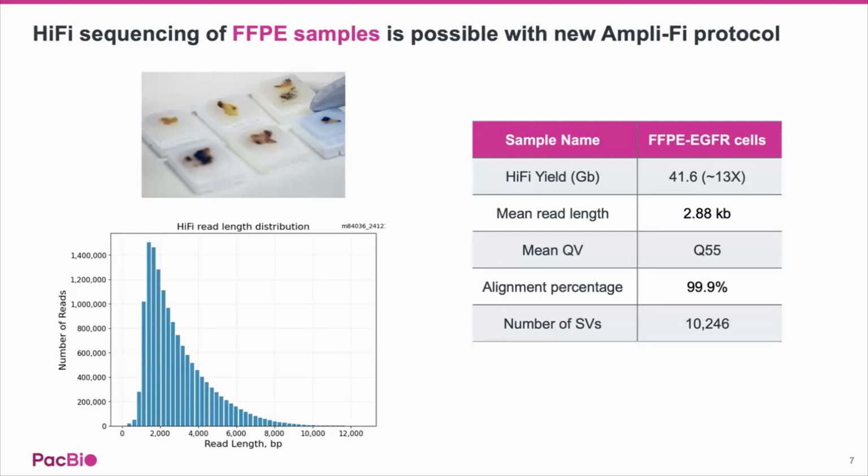The quality of the reads is really high because these short fragments mean many passes go through the circular SMRTbell molecule. Because these fragments are also shorter, we will get slightly lower HiFi yield than regular large DNA fragment libraries.